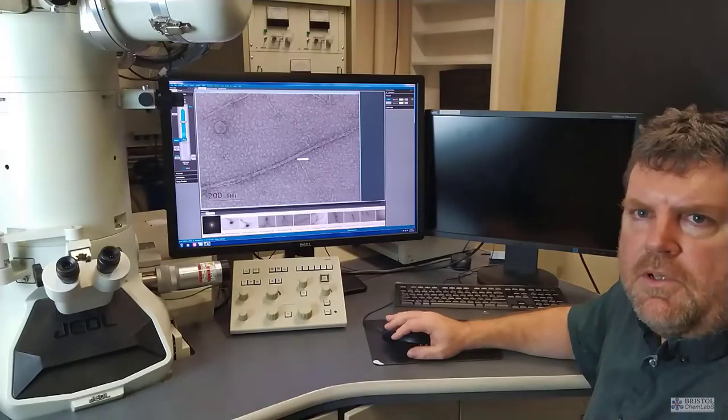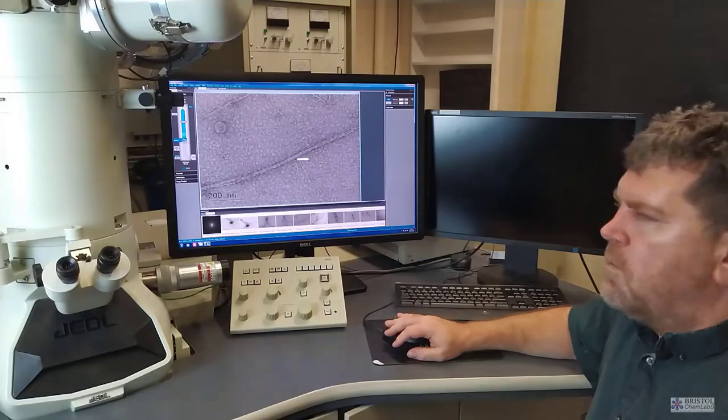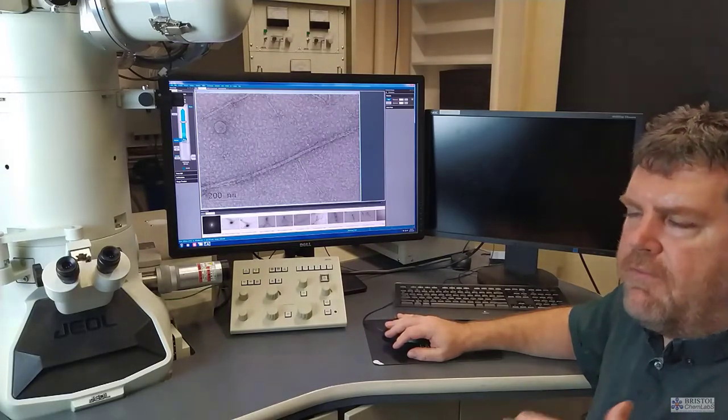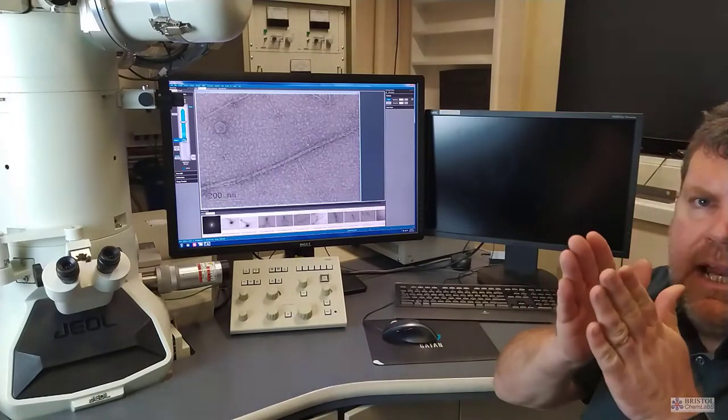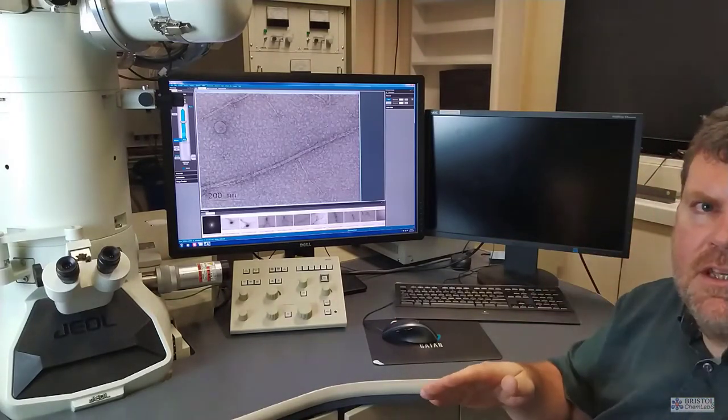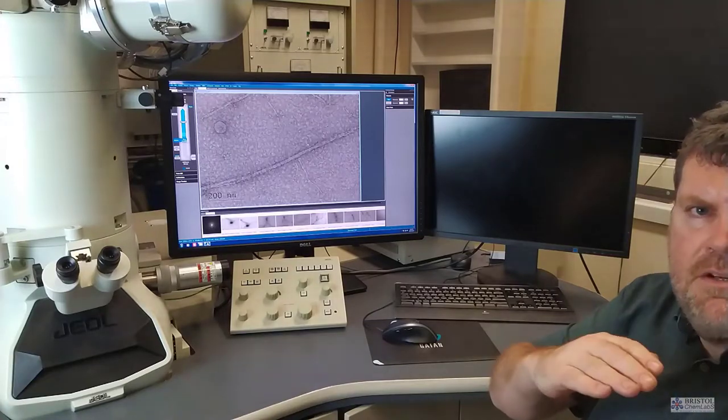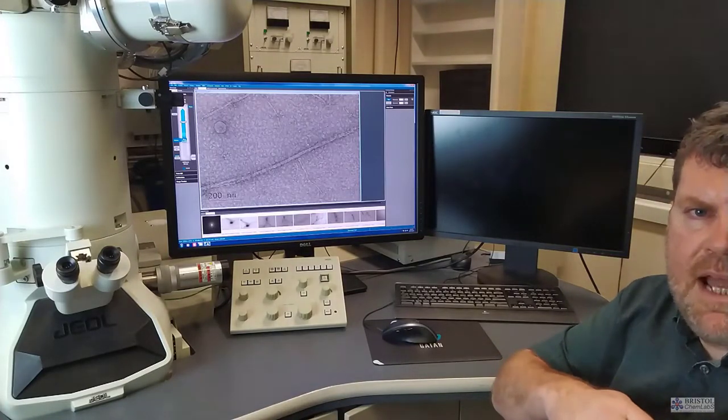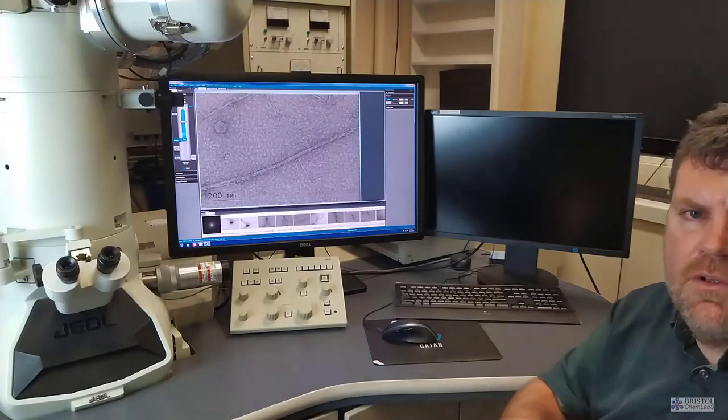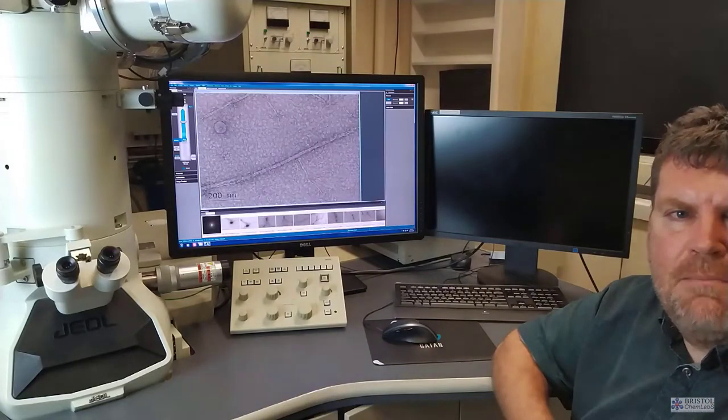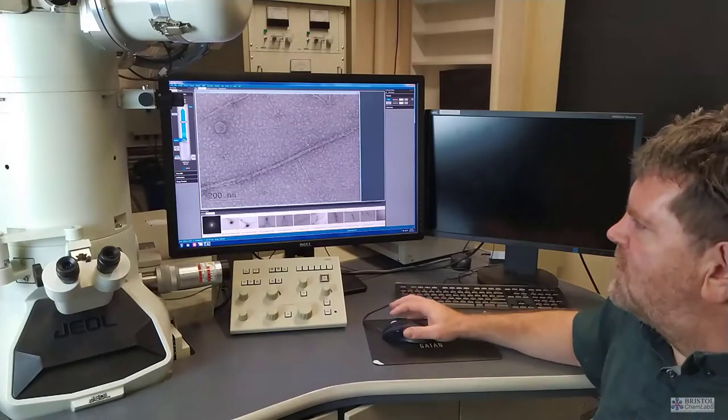For inorganic materials like gold, which are very high atomic weight, we get very good contrast in the transmission electron microscope. Because effectively, the electron beam is being scattered by the constituent atoms. So the thicker a material is, or the constituent atoms are higher atomic weight, the more they're going to scatter the electrons. Those particular regions will appear darker in the image.